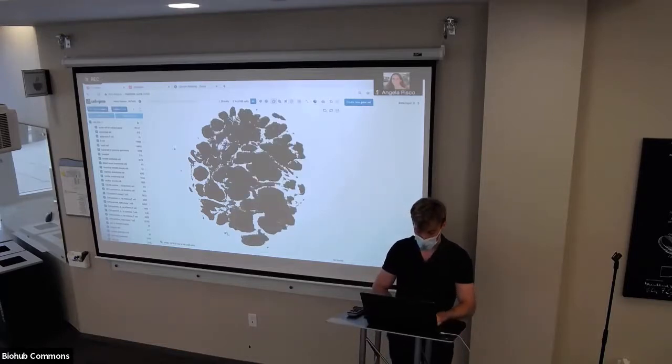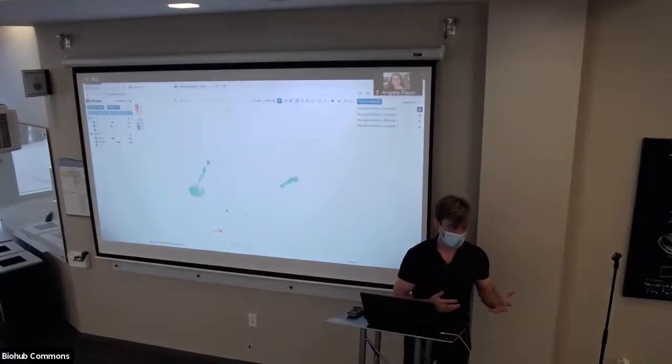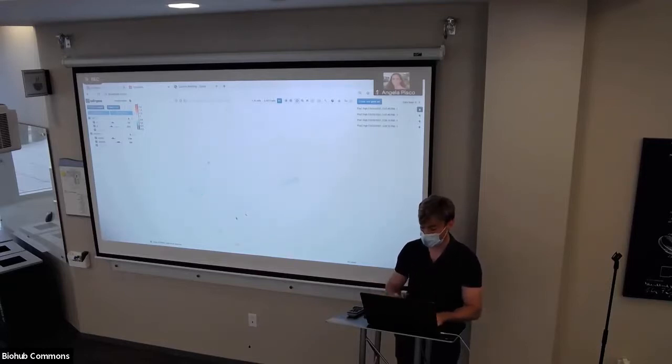And then the last thing that I made so far, and now that we have a framework for hotkeys, anybody can make a feature request and I can make a hotkey to do it really, really easy. But these are the ones I have so far.